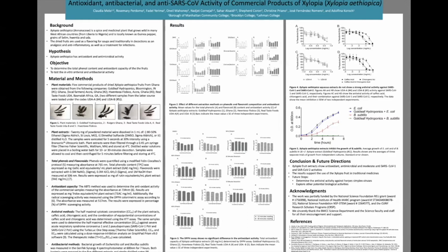We also looked at the concentration of flavonoids, which are a subgroup of the phenolics, and observed similar results. I'm referring to figure 2b. Following, we tested the antioxidant activity of the extracts using 2 different tests, the ABTS and DPPH tests. In the ABTS test, in figure 2c, we observed that the highest antioxidant capacity was in sample 4 and 5 using the decoction method. In the DPPH test, we observed that there was no difference between the samples, and this tells us that the ABTS assay is more sensitive and accurate than the DPPH.